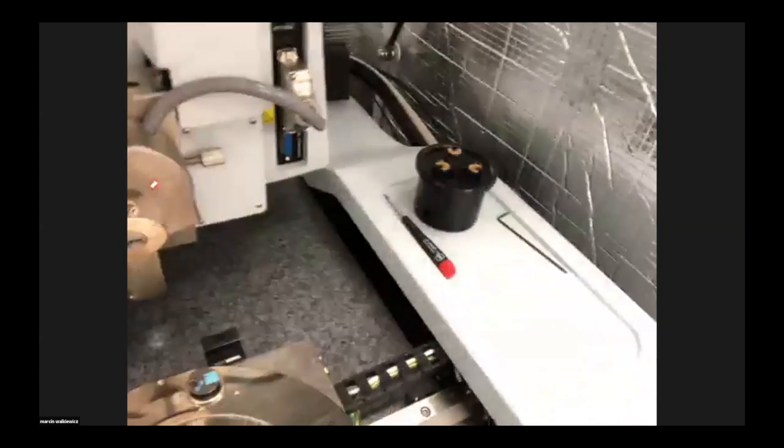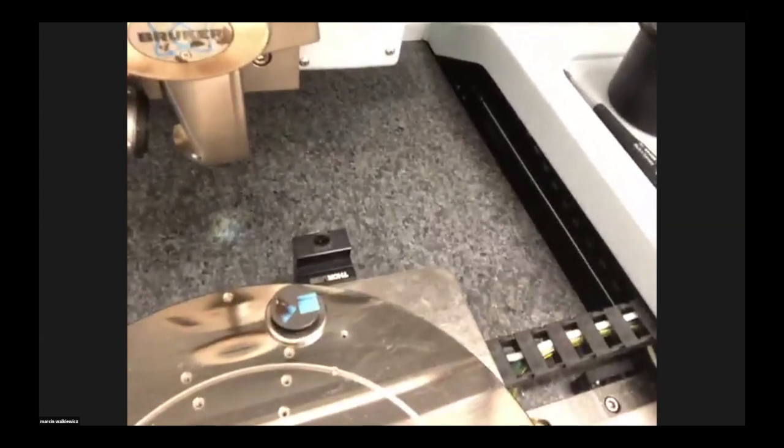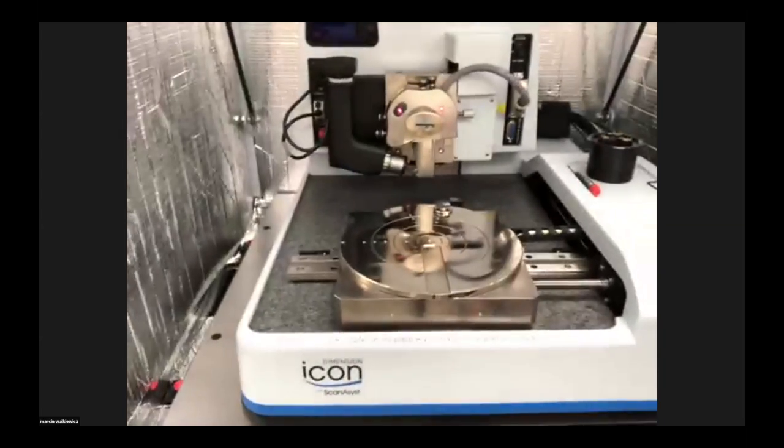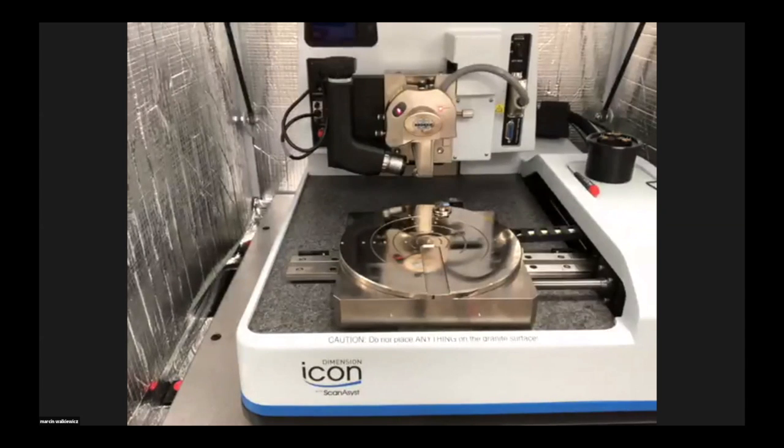Angela gave me the wings. I prepared them. You can see them here on the stage. That's the sample with the wing. All right. Now we're going to send it under the microscope.